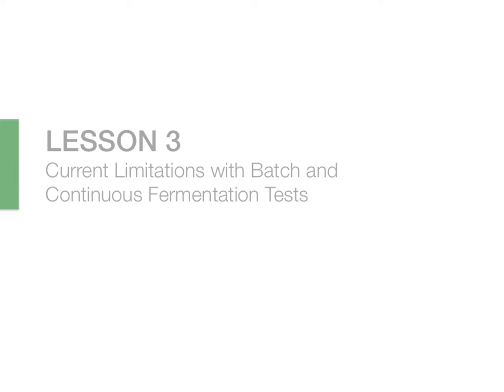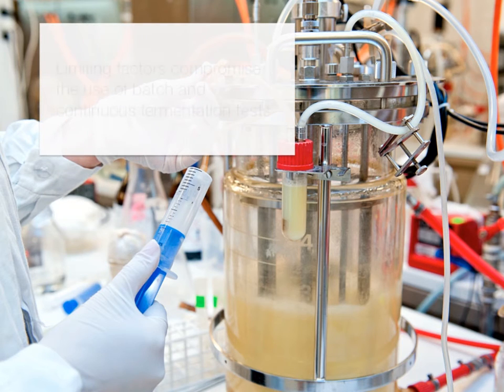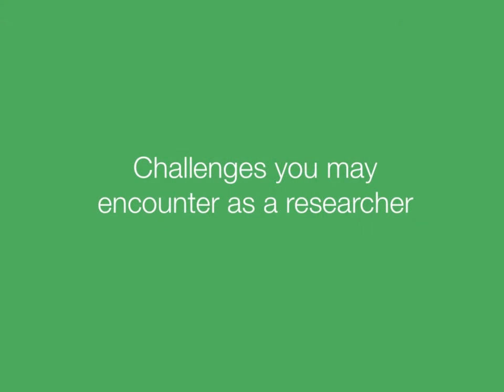Lesson 3. Current limitations with batch and continuous fermentation tests. Although the two methodologies presented in Lesson 2 show significant potential in helping researchers accomplish their characterization objectives, there are a number of limiting factors that compromise their usability. Let's take a closer look at the challenges you may encounter as a researcher.